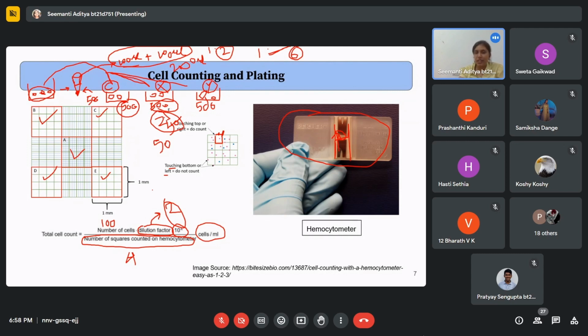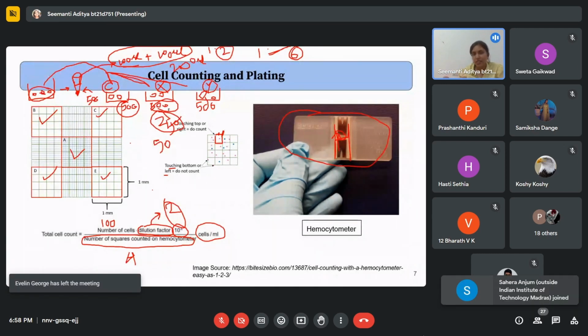It has just reduced from 250 to 50, not from 500 to 50. So we have to be careful that the initial number of cells has to be similar to control and similar in all the cases, so that it is easier to compare between the different conditions, and that will give you a more statistically relevant result rather than using different numbers of cells in different conditions.